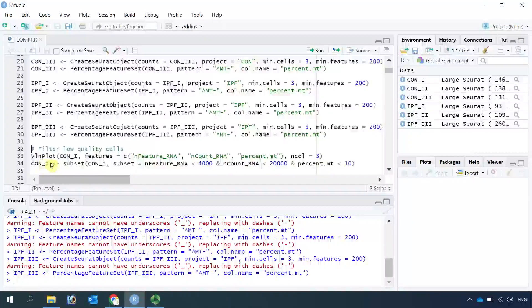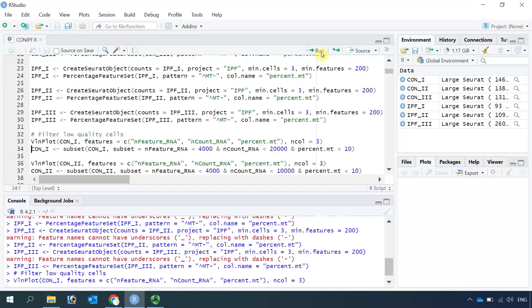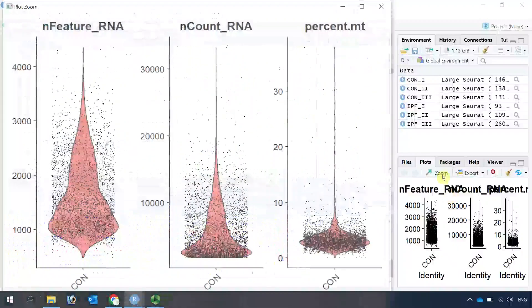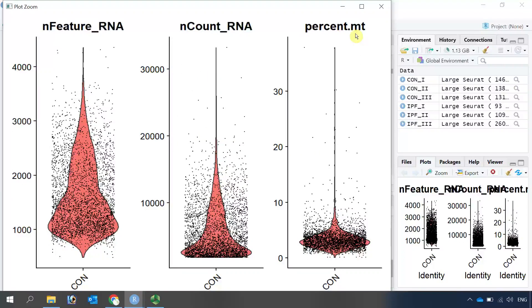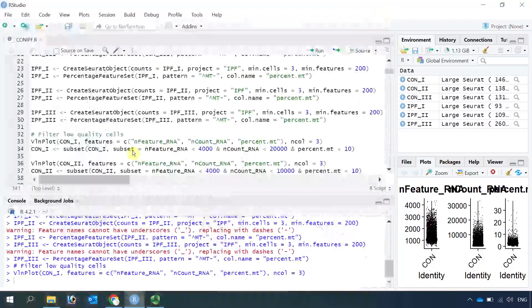We can use the violin plot to look at the features for each object: nFeature_RNA, nCount_RNA, and the percentage of mitochondria genes. For control1, the majority of cells have nFeature_RNA below 4,000, the total count below 20,000, and the percentage of mitochondria DNA below 10 percent. We can use the subset function to keep cells with nFeature_RNA below 4,000, count below 20,000, and mitochondria DNA percentage below 10 percent.